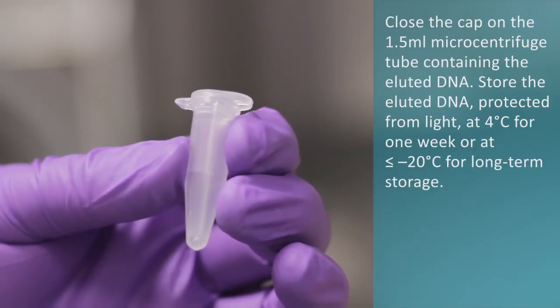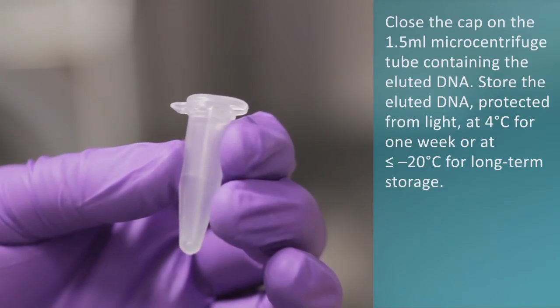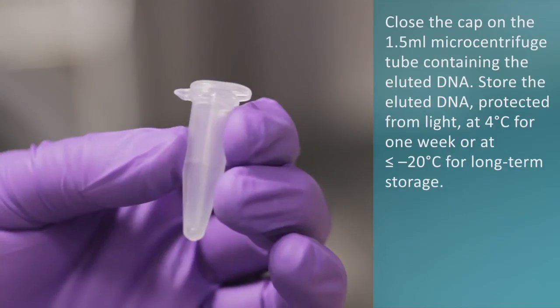Store the eluted DNA, protected from light, at 4 degrees Celsius for one week, or at or below minus 20 degrees Celsius for long-term storage.